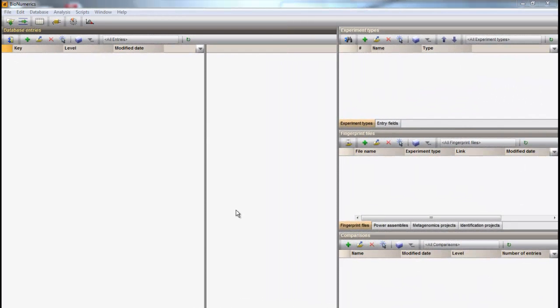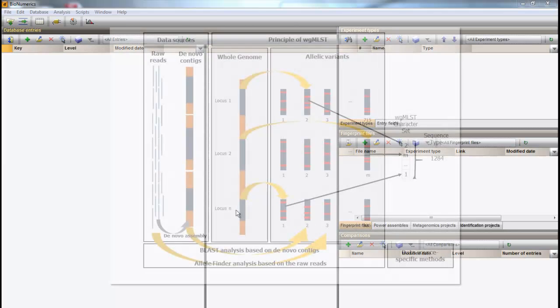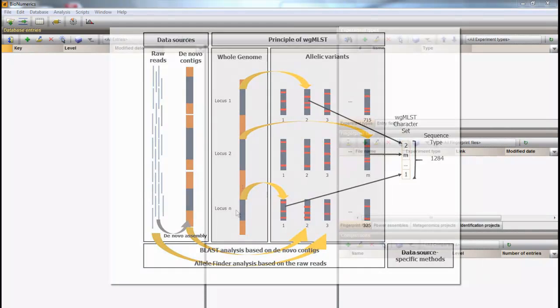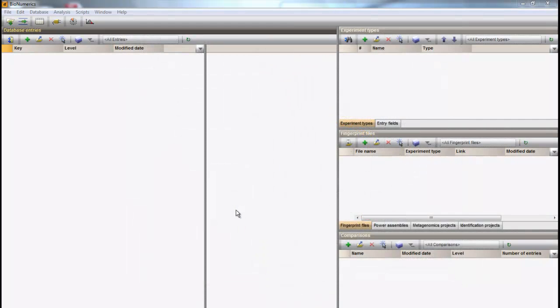The Whole Genome Multi-locus Sequence Typing plugin from Bionumerics performs MLST on a genome-wide scale. For each sample, the locus presence and the corresponding allele variant is determined.